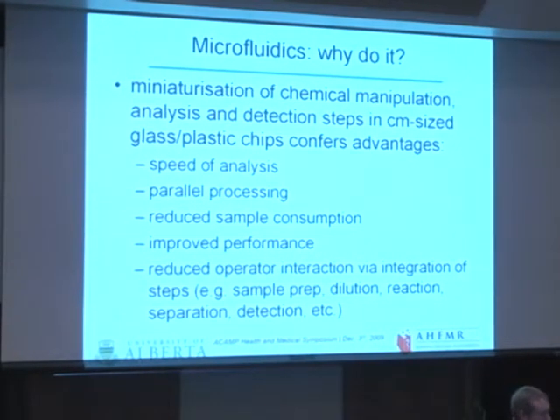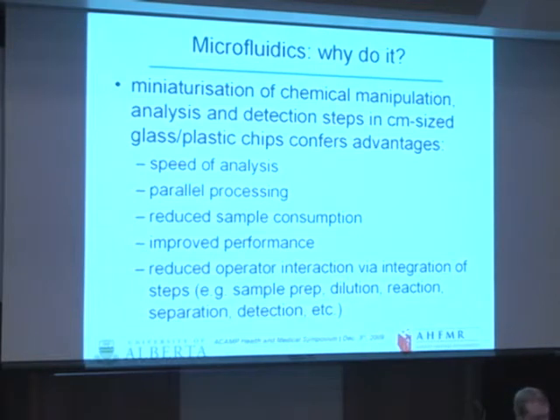Sometimes some of these operations that you're doing, such as capillary electrophoresis, have better performance just because the dimensions are smaller. And one of the biggest ones, especially from a product development or industrial perspective, is reduced operator interaction. That means that your product arguably has legs. Your product now is one thing that does a whole lot.